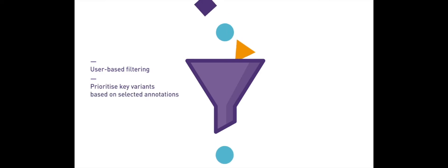With SNPnexus, users can quickly and easily apply complex filtering steps to prioritize key variants based on the annotation categories selected.